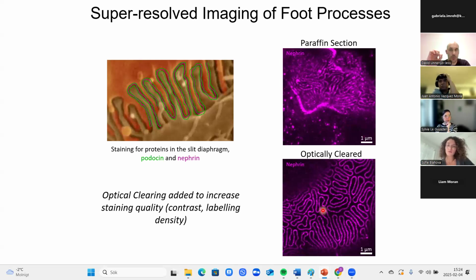But I think when applying expansion microscopy, you would only apply it to smaller fields of view where you have a high resolution scientific question. So it's a very bad method if you want to image large samples, of course, because it will take you much longer. And it's 5 times linear expansion, so it will actually take you 25 times longer.